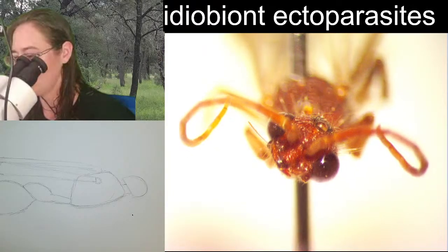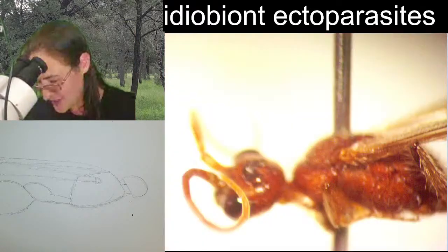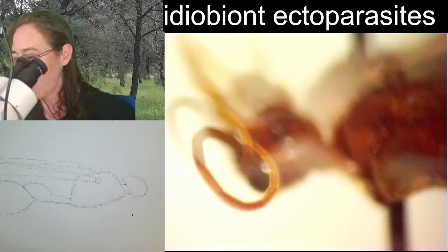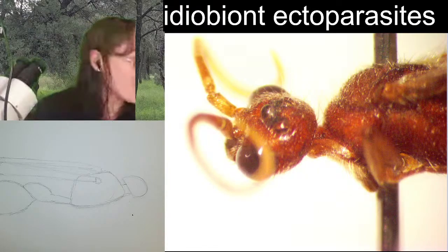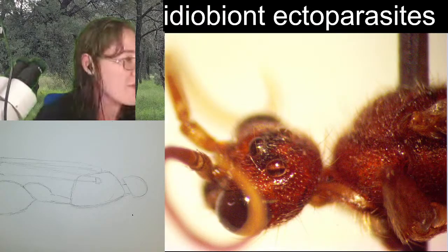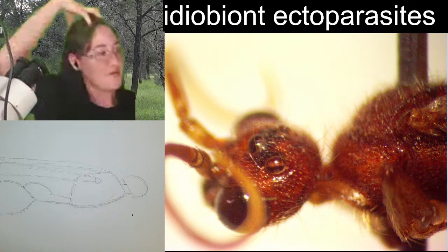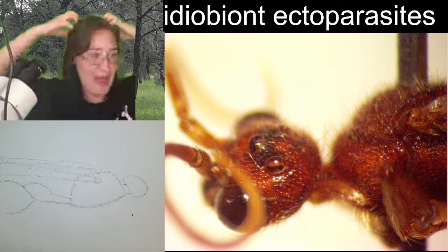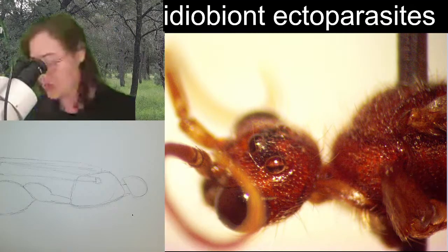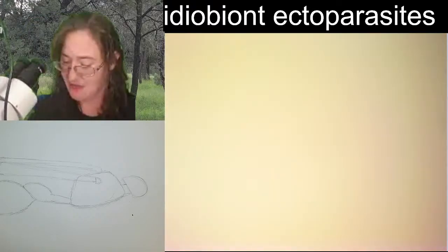I'm turning the specimen a little bit because I want to see if that was really a maxillary palp. But there's the ocelli, if you'd like to look at them from this point of view. All three of them in a little triangle. They are also kind of on a mound on the top of the head, so the one on the front is looking forward, and the two on the back are pointing out. They're on that hill. I'm going to flip this specimen upside down. I'm going to take off its label. Don't let me forget to put it back on.